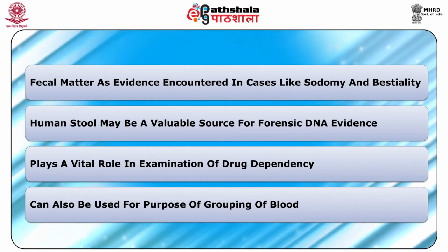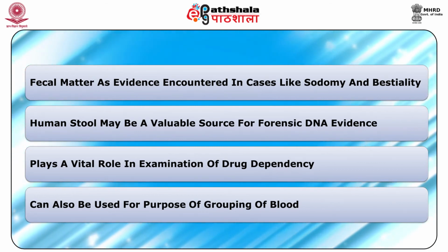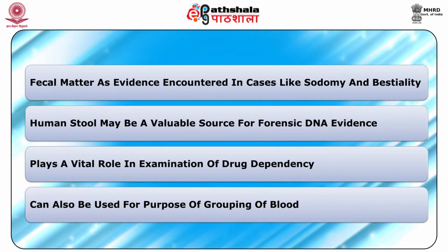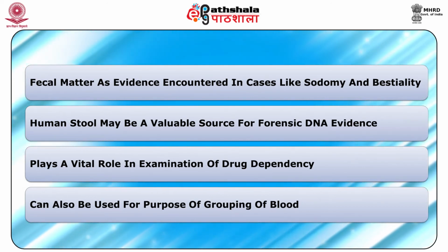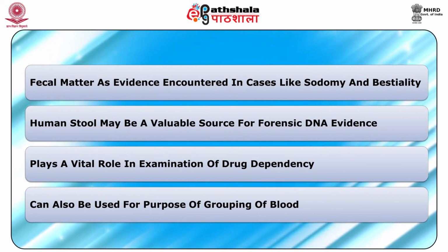However, due to microbial presence in the gastrointestinal tract, the extraction of human DNA from feces may be challenging. Also, stool contains high levels of compounds that can degrade DNA and inhibit downstream PCR reactions. These compounds must be removed for reliable analysis of extracted DNA.